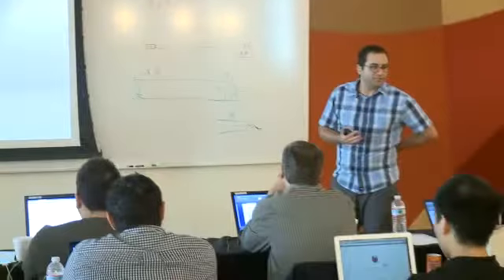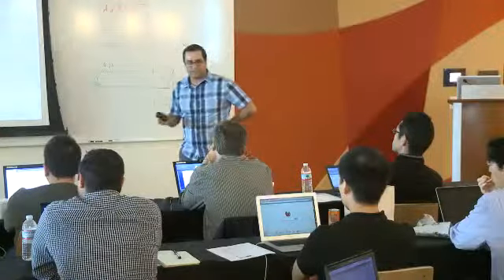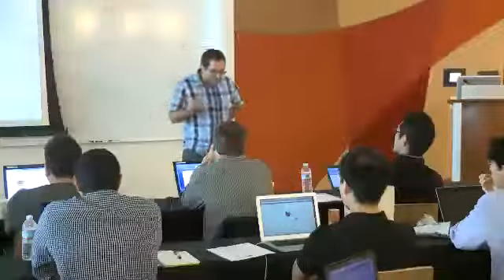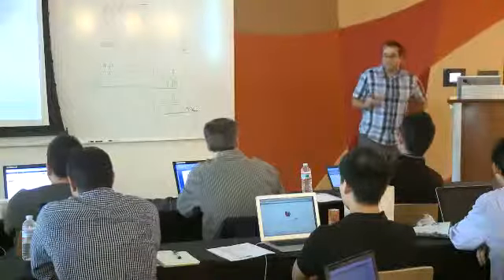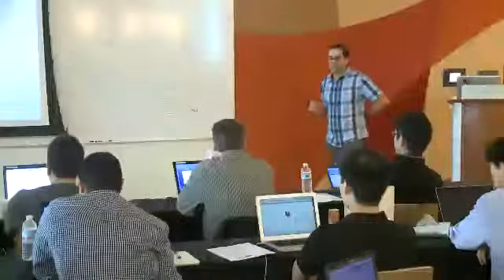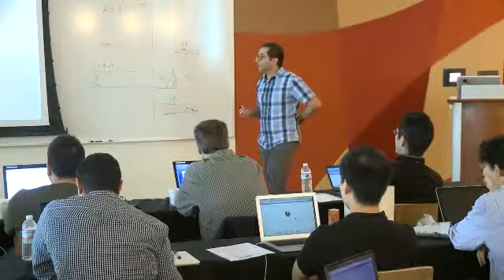And now the way that I like to do it is I gave you the handout. I think that you can all just go and follow up on them. And if anyone has any questions or something is not clear, just raise your hand and I'll try solving it. The basic idea behind what I was trying to do here is to give you a taste of the approaches that we use for analysis of ChIP sequencing data.